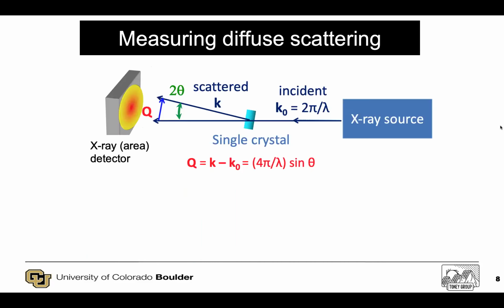So how do we measure this? This method has actually been around for a long time. I don't have it in this talk, but I think it dates back to maybe the 40s or so. What has happened recently, both on the X-ray side and the neutron side, is a step change in our ability to measure it. If I think about an X-ray experiment, there are three pieces: the source, the detector, and then the sample.